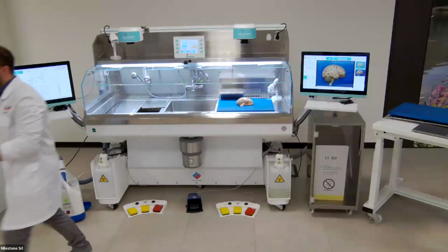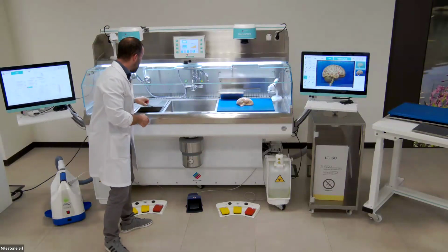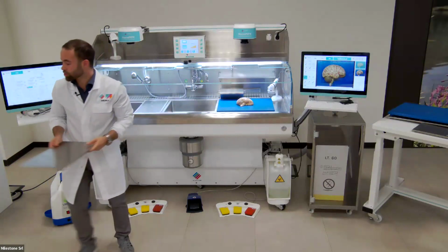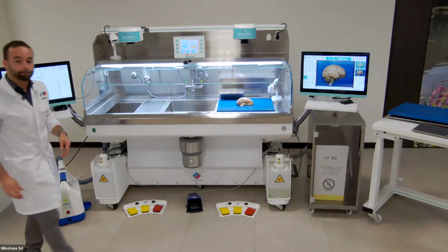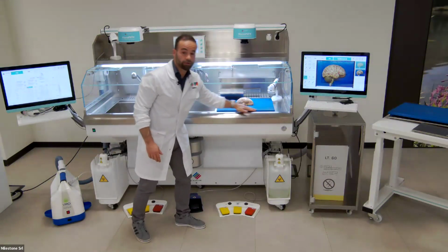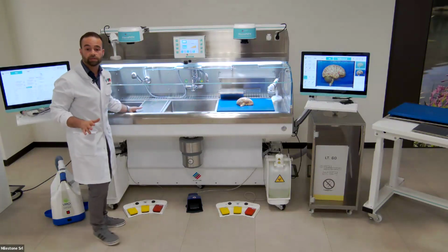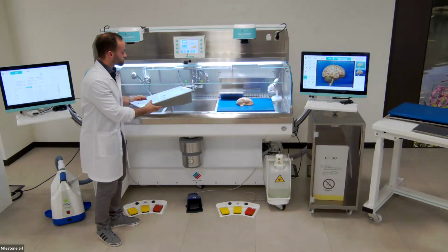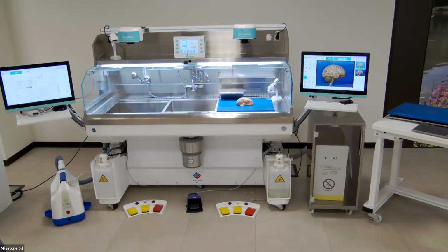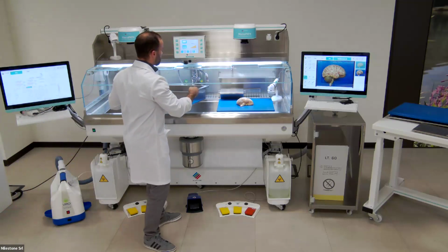Definitely, I can show it. Probably you don't see pretty well, but I try to show you the real dimension of our big basin. This is 150 centimeters long. That means that this module is 50 centimeters, and we also have two modules of 25 centimeters each. So just for you to understand, that is a meter and a half.